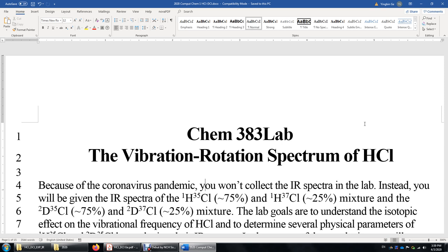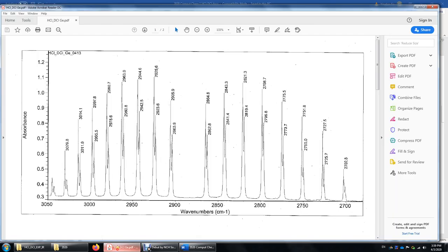First, I will show you the IR spectra of HCl and DCl. This is the IR spectrum of HCl. The horizontal axis is the infrared wave numbers in inverse centimeters, and the vertical axis is absorbance.